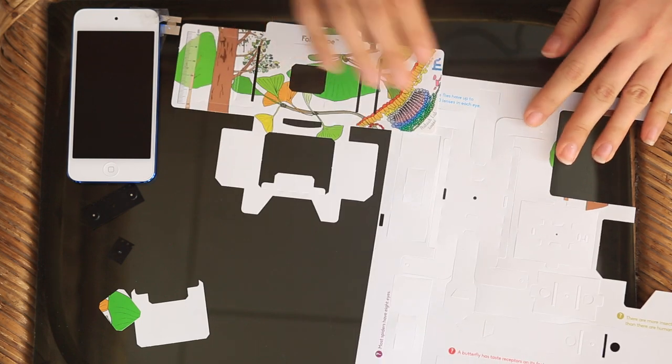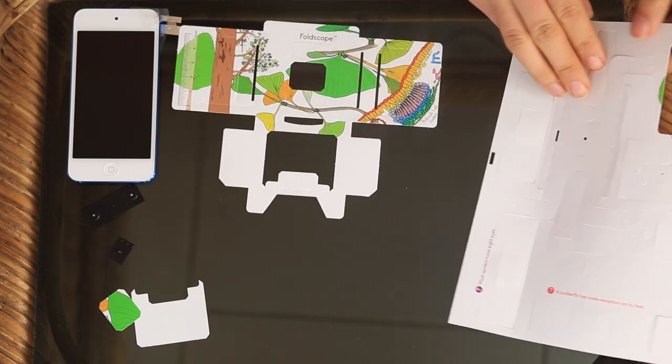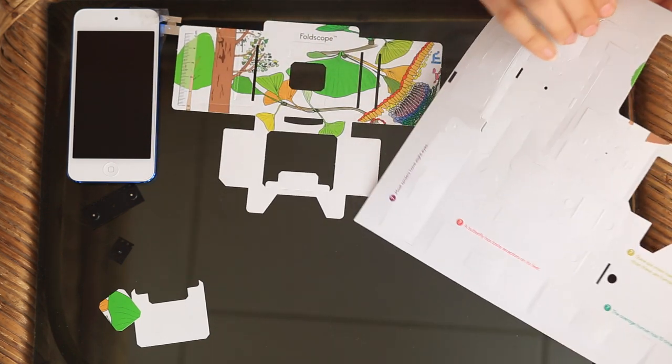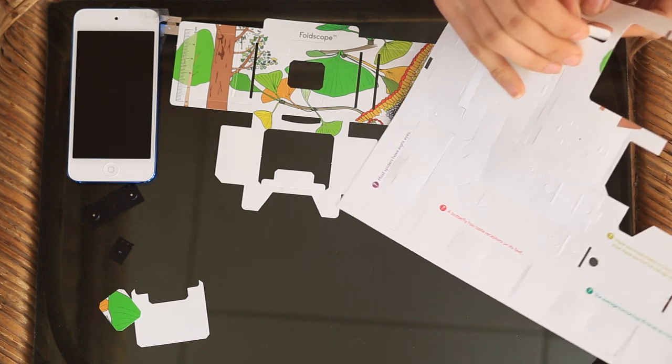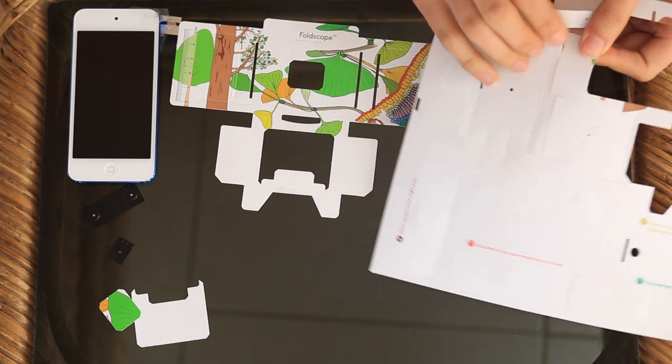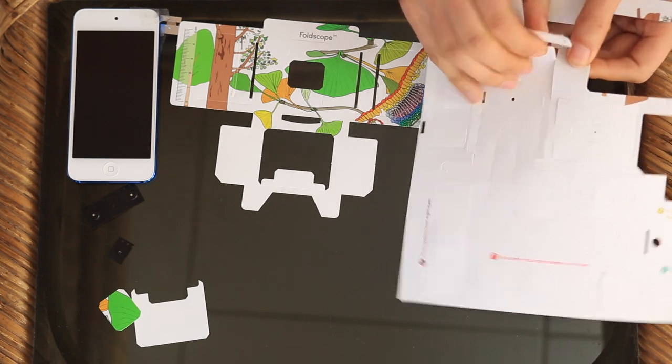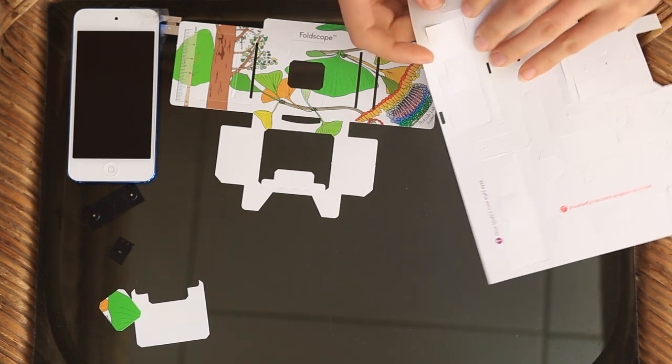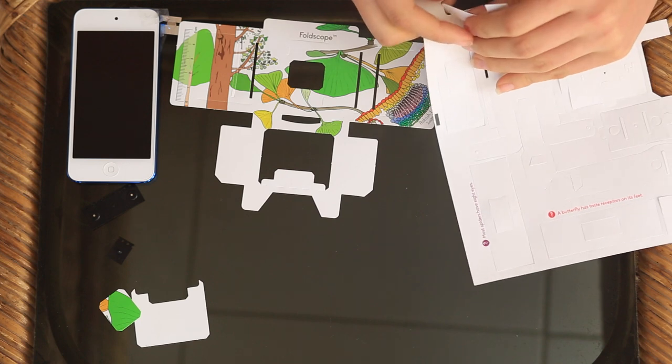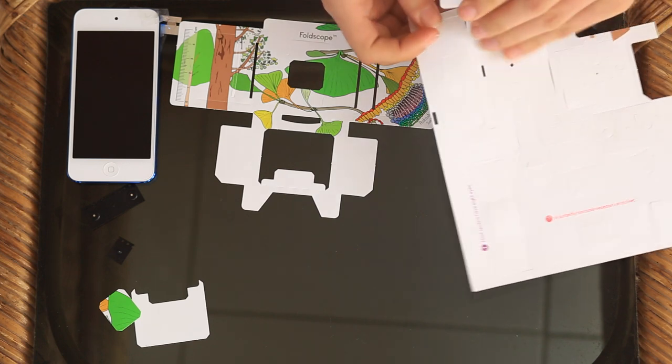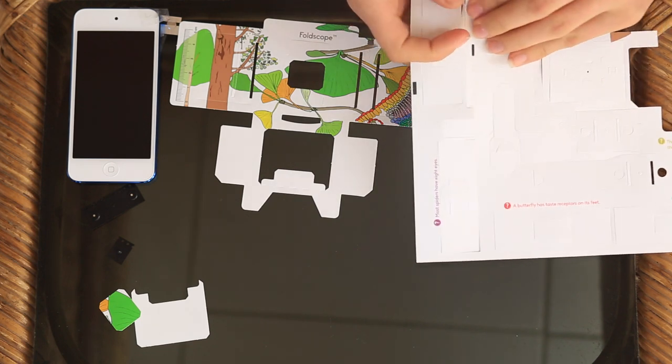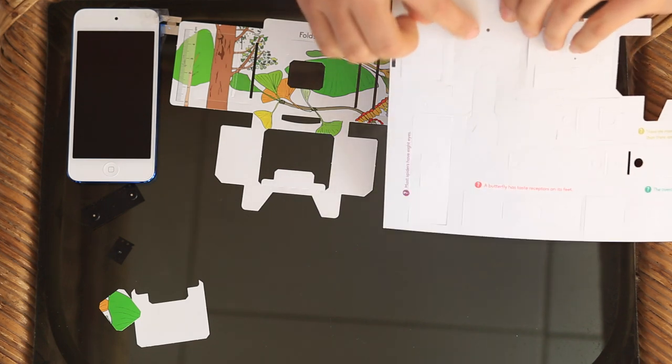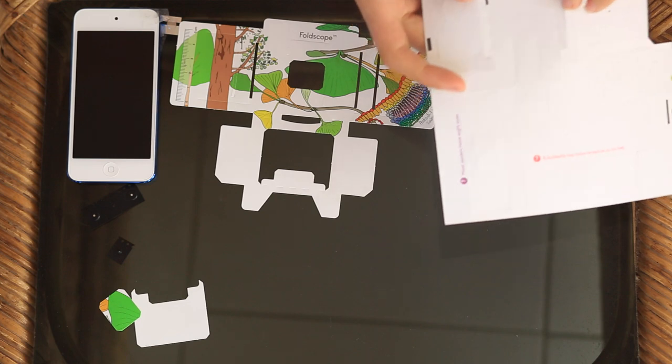The second main part of the Foldscope is the part that we usually tell children is called the turtle. And the turtle is the illumination stage. This is the stage that holds both whatever your light source is.